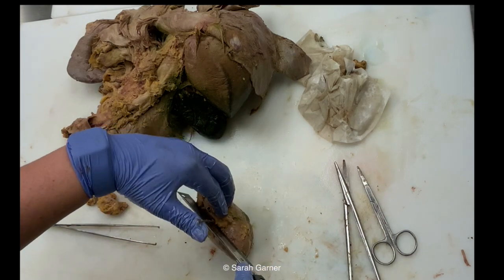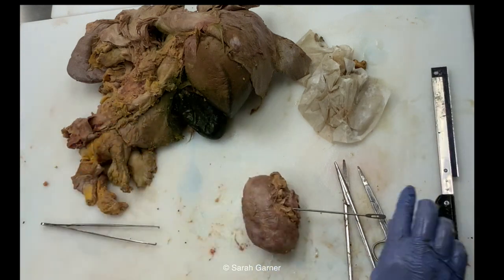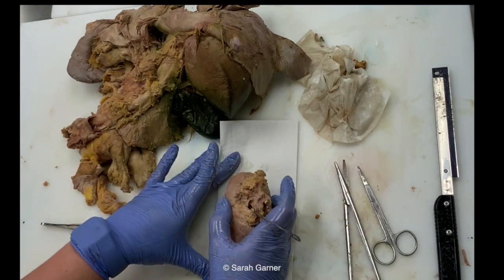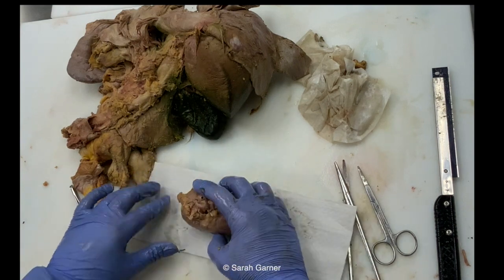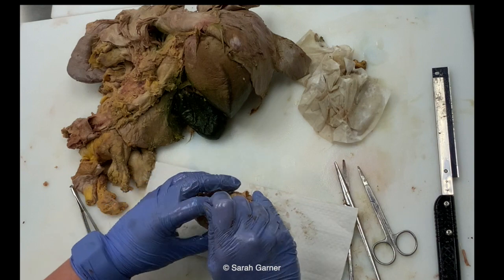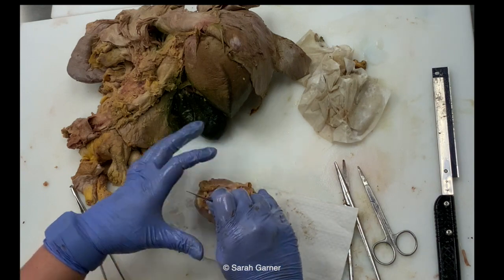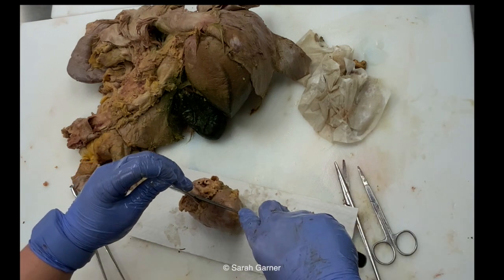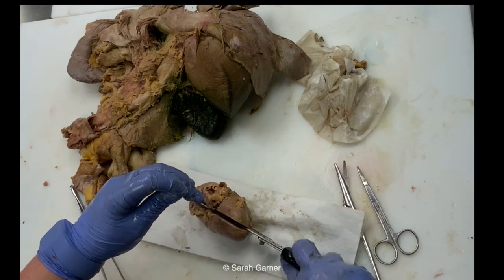This is probably not going to turn out very well. This is very slippery. So if something is slippery, you can always put a towel or a paper towel under it. If you're cutting on a cutting board, it can get really slippery really fast. So that is just a helpful tip. You can also hold it down with a paper towel. All right, let's see how it turns out.